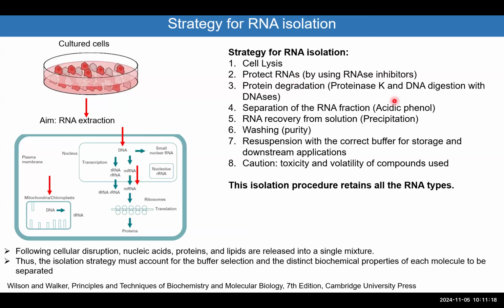You also want to get rid of any proteins, and particularly you will do a digestion with the proteinase K. That's in many kits that we use in the labs. You will find this component, and you will digest any remnant DNA or genomic DNA, because you don't want to have a contamination of your RNA with the DNA. So many times we do DNase digestion for the sample, so that in this step, you are assuring that you will not have any more proteins or DNA in your samples.